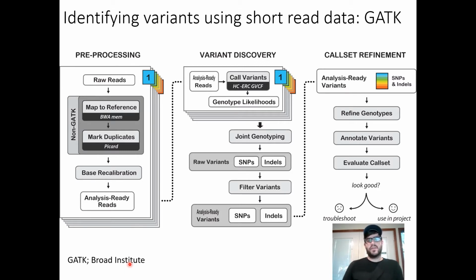And so there are a lot of steps to this pipeline. We won't run it in this course because it can take days or weeks. It's very computationally intensive, depending on the number of individuals you have. That's because you have your pre-processing where you're aligning all the reads against the genome. And then when you're actually discovering the variants, GATK is very sophisticated and does a really good job, with a lot of quality control metrics. It takes a lot of computational power, searching along individual reads, identifying variants, filtering them, joining them, things like that. So we won't run this in this course, but we'll talk about the conceptual framework.